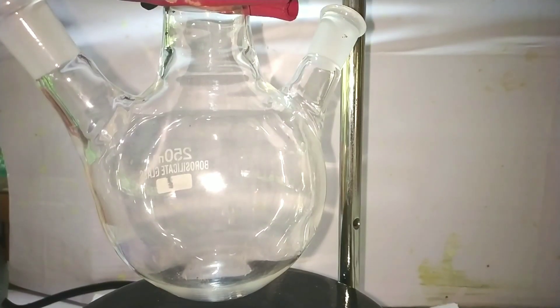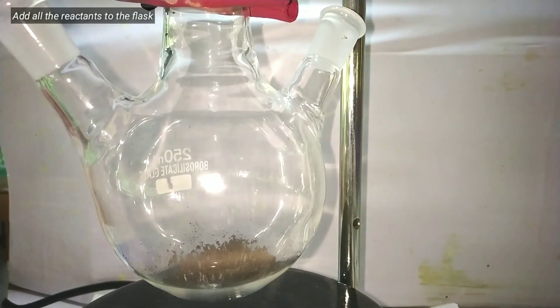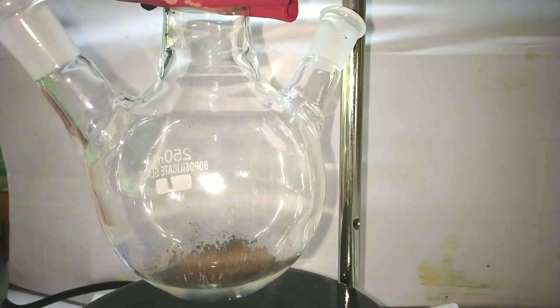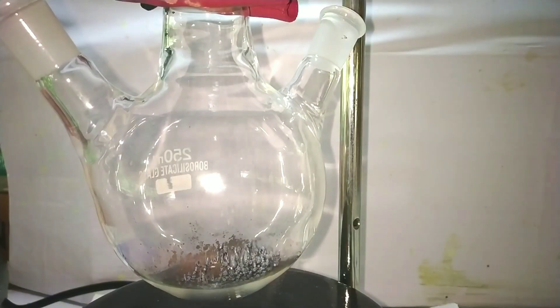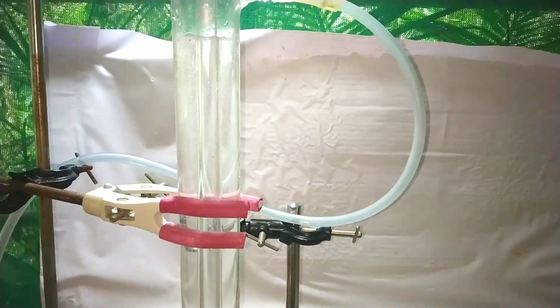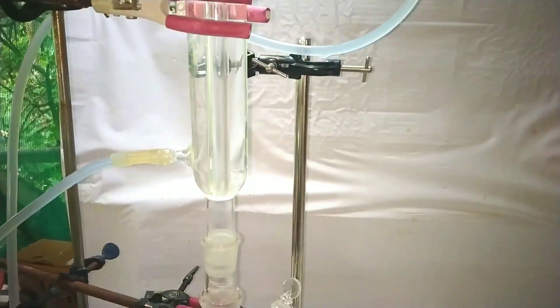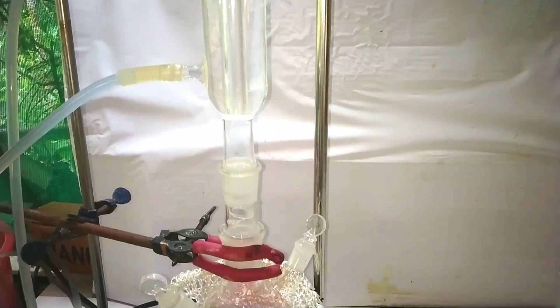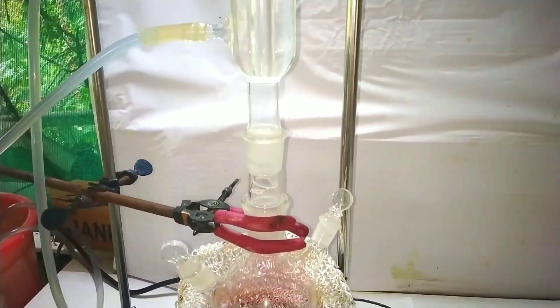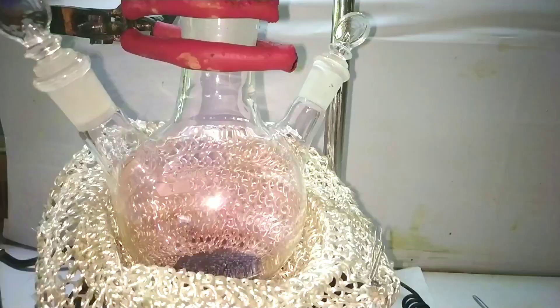Start by taking a 250 milliliter three neck round bottom flask. First we add 3.5 grams of antimony powder into it, then we add 7 grams of iodine crystals on top of that. Attach a reflux condenser on top of the flask and start pumping water through it. The two side necks are closed with a glass stopper, and a heating mantle coil was placed below the flask to provide uniform heating.